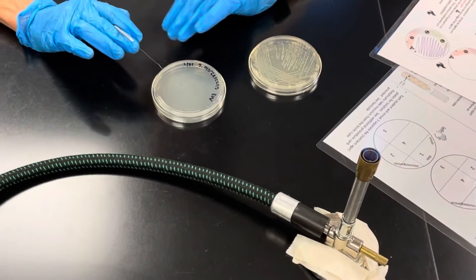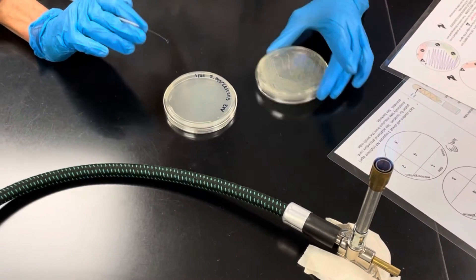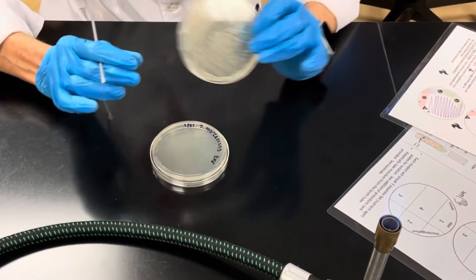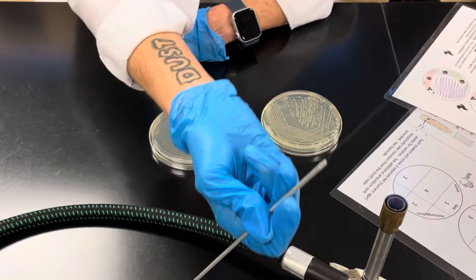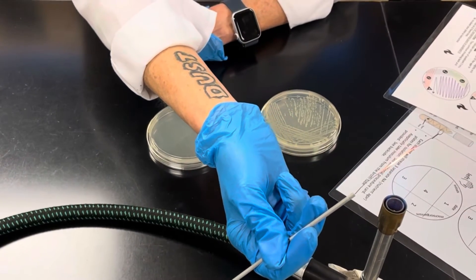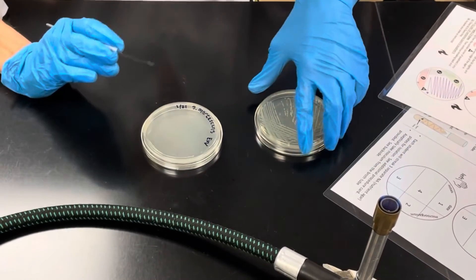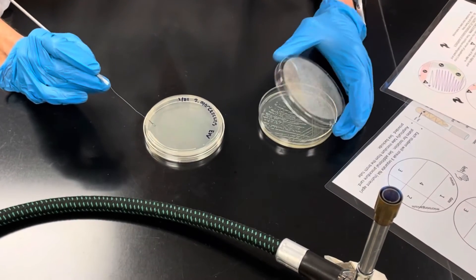Another way to streak a plate for isolation is without the lines. Personally I'm not a line person, so what you end up with is a more free-flowing streak pattern. You would still flame your loop from the base to the tip to sterilize it and then try to select an isolated colony.